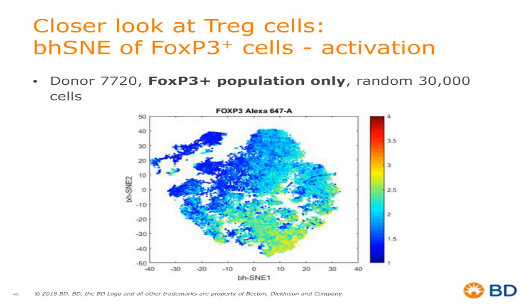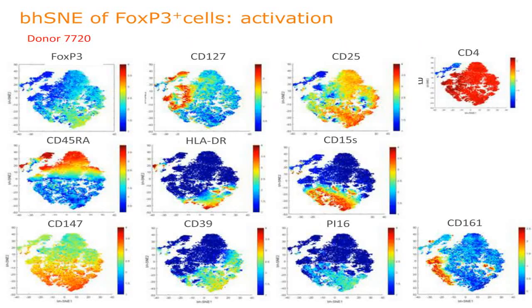So some are what we would say are low expressors, even though they're positive. And then you have a continuum or an area where those actually have much higher expression in the lower right-hand corner. And so I'd encourage you to keep an eye on this lower right-hand corner because it's going to tell us a little bit about the heterogeneity of these T regulatory cells. Because these that are FOXP3 high, I should say, they're all FOXP3 positive, have different levels of expression of other markers.